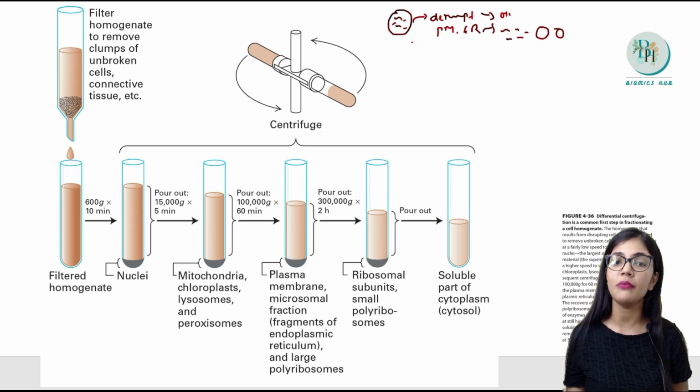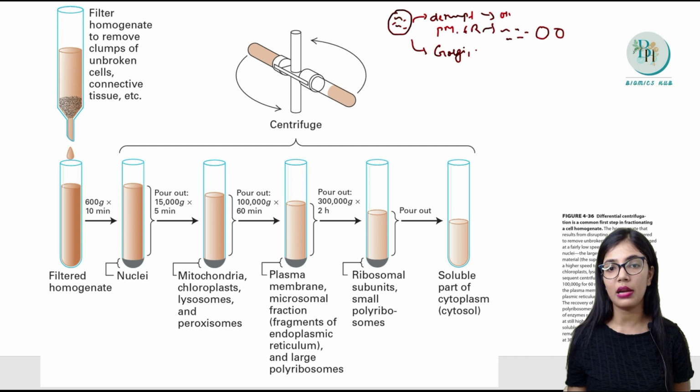There are also some intact organelles, like the Golgi, ribosome, peroxisome, and mitochondria.